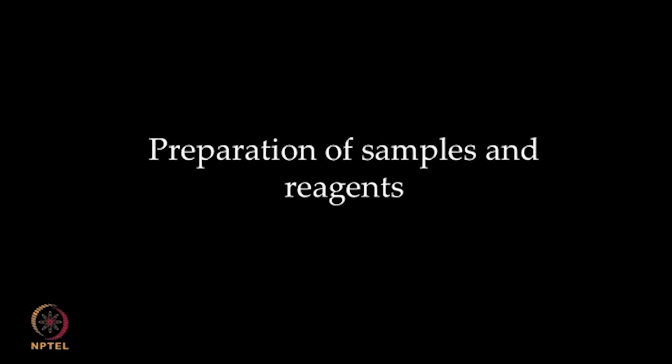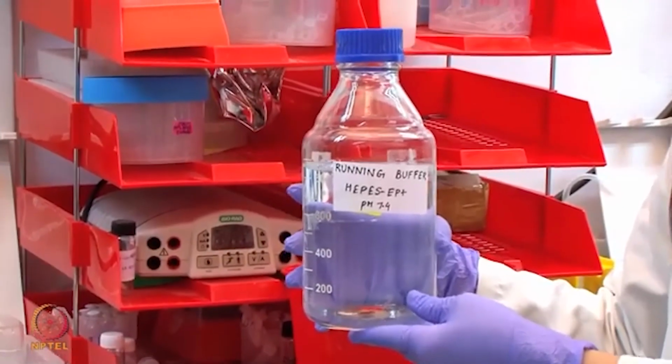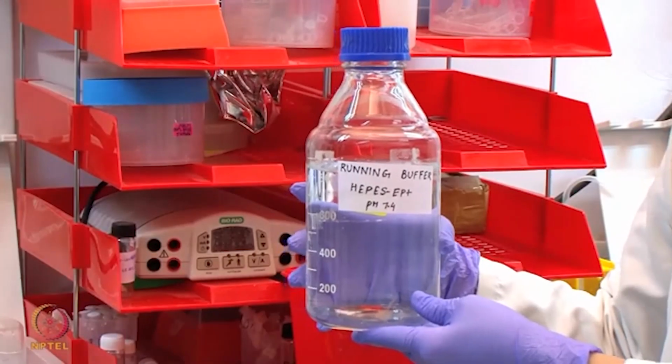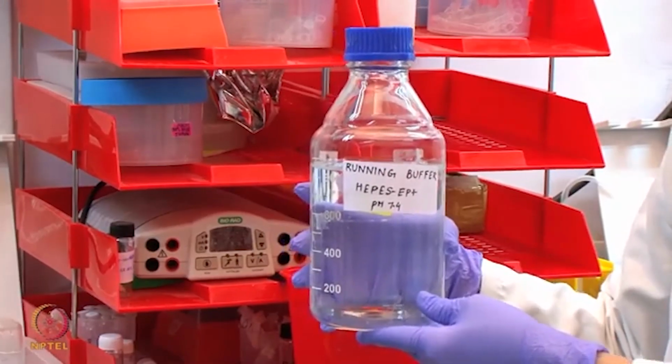We will now work on the reagents required for the binding analysis of anti-beta-2 microglobulin with beta-2 microglobulin protein. We will be using HBS-EP+ as the running buffer, which will also be used for the initial startup cycles.